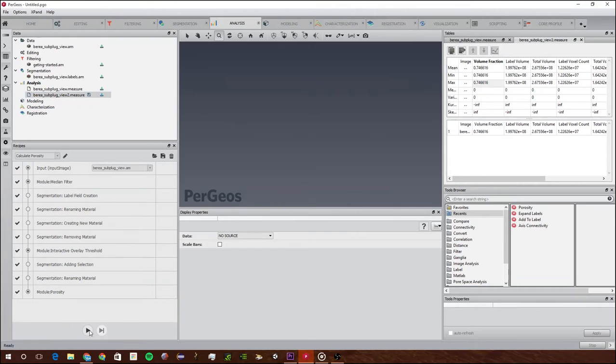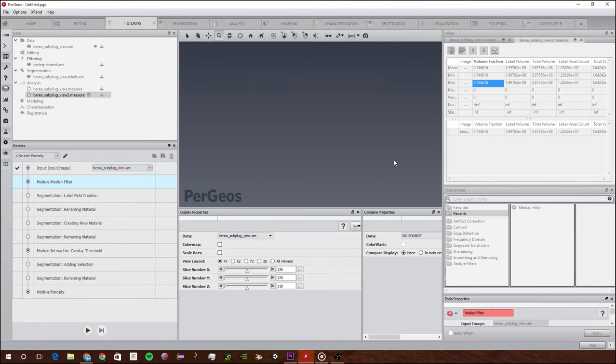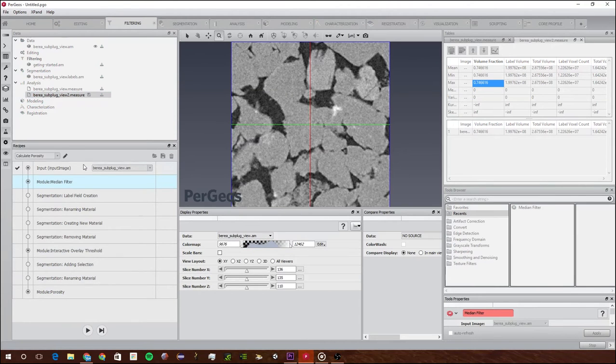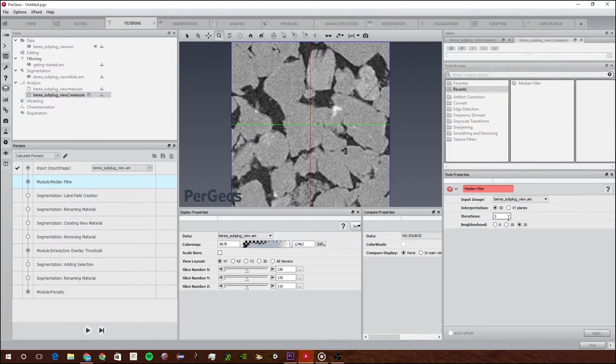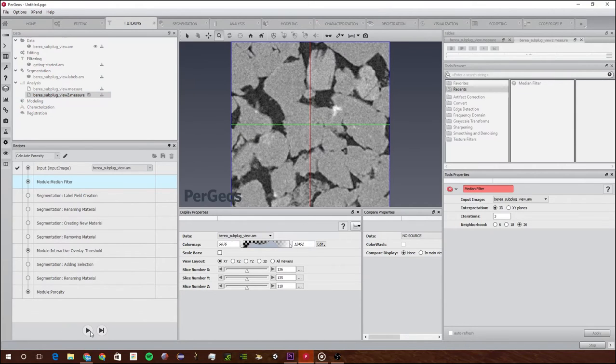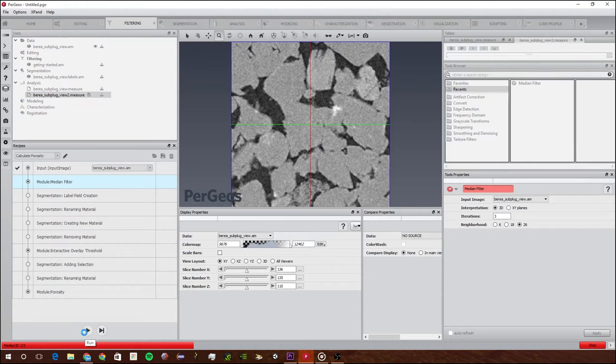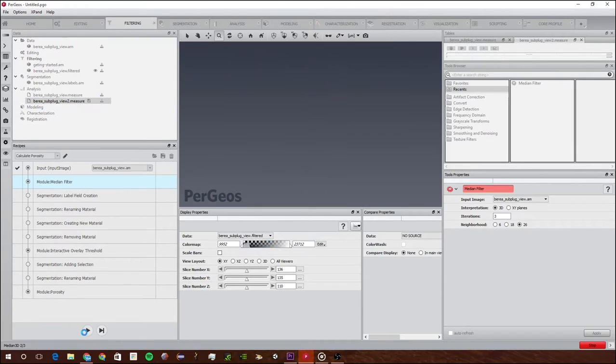Now when I run this, let's see what happens. It stops and tells me you want to run the median filter. I can choose the interpretation and I'm just going to choose 3D for this one. Then I just click continue and it's going to continue to the next part.